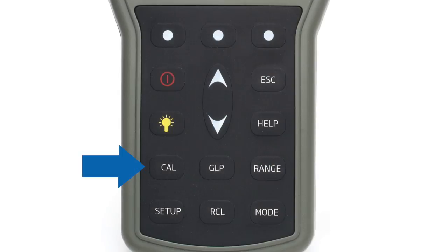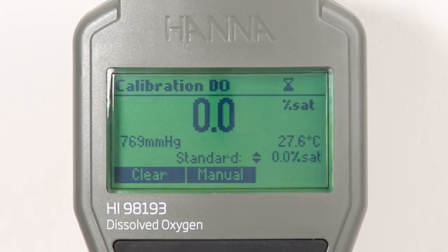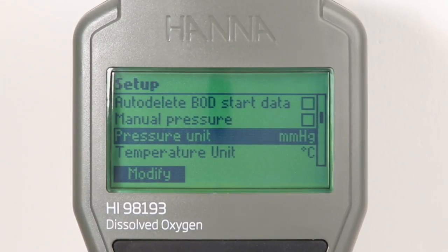Pressing the dedicated CAL button allows users to enter automatic calibration. Calibration can be performed for dissolved oxygen up to two points at 0% and 100% saturation. The integrated temperature and pressure sensors may also be calibrated.